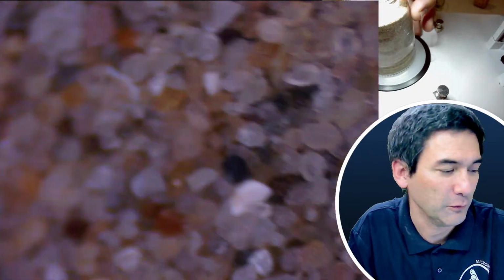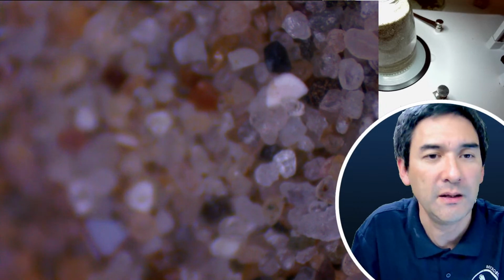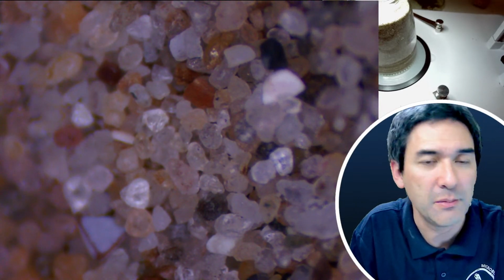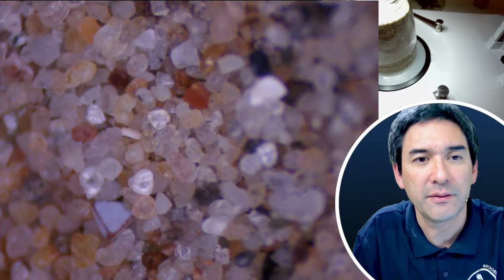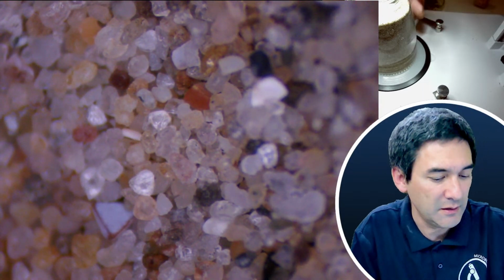It's difficult for me to pronounce, one of the longest names. This is the beach in the Netherlands, which I visited 20 years ago because I was at a workshop. And I got a few more sand samples, but I think right now we are interested in the polarized light.